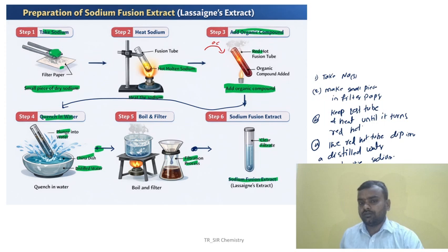Then sixth, filter. Then you finally get the sodium fusion extract. So this is the step-by-step process of preparation of sodium fusion extract.